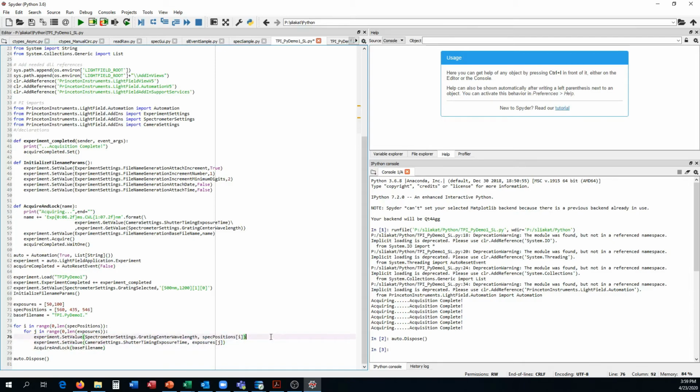That's the opposite of asynchronous. The benefit of that is obvious. You can't mess it up. You can't put it in a corrupt state because it'll lock the thread. It won't let you do anything else. It won't go to the next line. It won't execute the next command until this returns that it's free. So those are the asynchronous and then the synchronous commands.